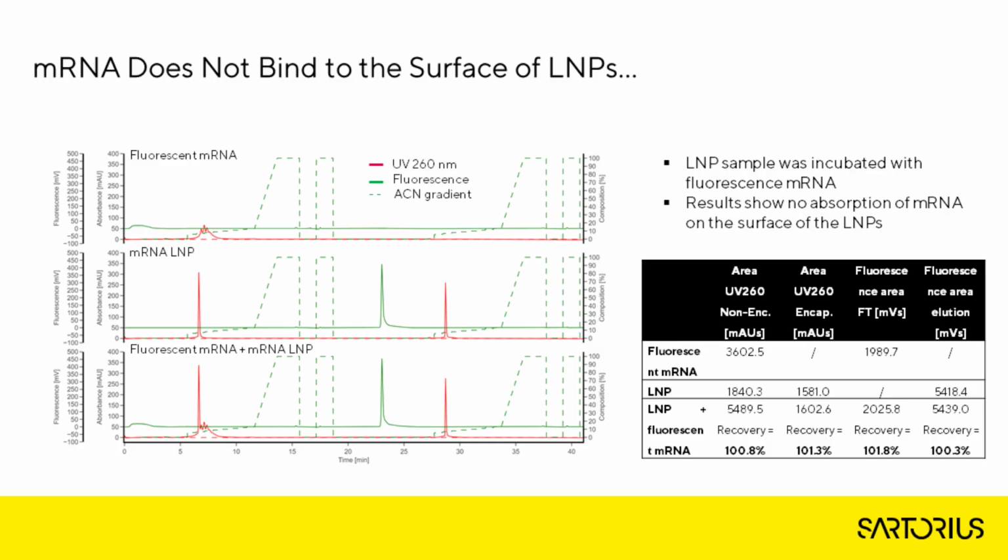We tested this with incubation of LNPs with fluorescent mRNA and tried to detect this surface fluorescent mRNA on the surface of the particles using this fluorescence detector. This result shows that no fluorescent mRNA was present on the surface of the particles. So this also confirmed that mRNA does not bind to the surface of the LNPs using this system configuration and the conditions in which particles are loaded on the system.